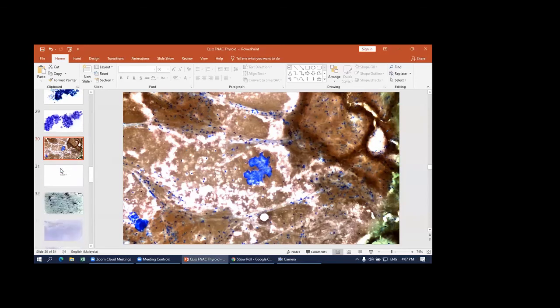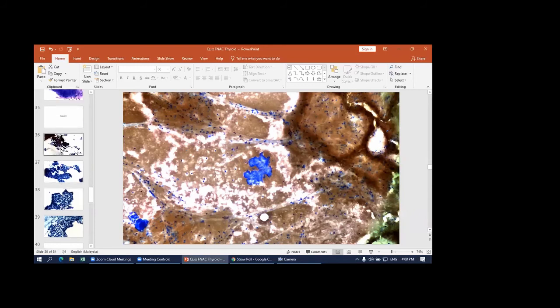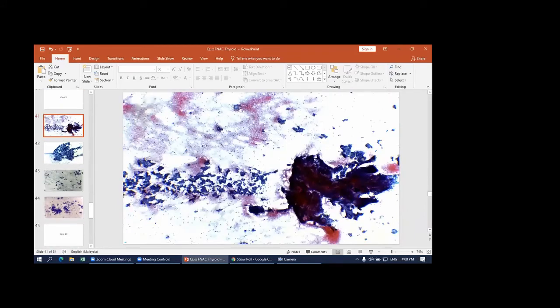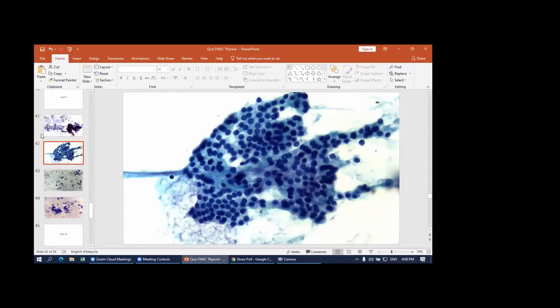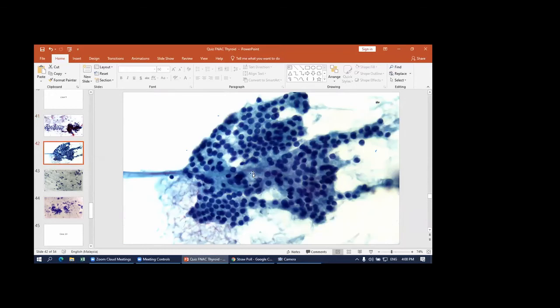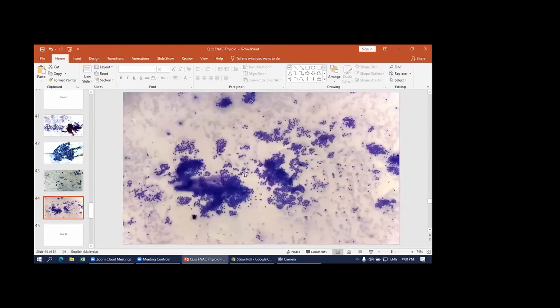This is the case. Okay. Remember the spaceship with the little ones of the spaceship? I forgot to show you just now. There's actually an area that looks like a fibrovascular core there and there. Nuclear wise, there are no nuclear features. The majority are microfollicles. It's a bit more similar looking. Quite a number of them have these dispersed looking microfollicles as well. And this is the MGG.